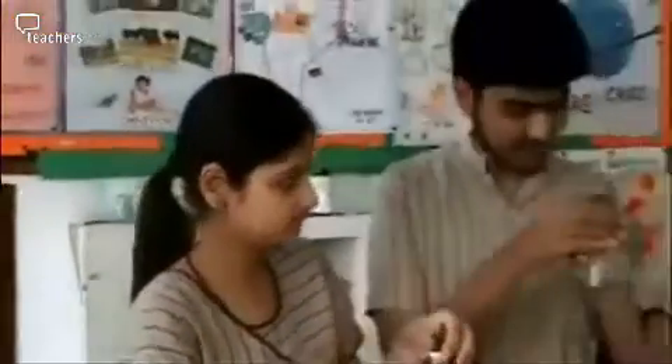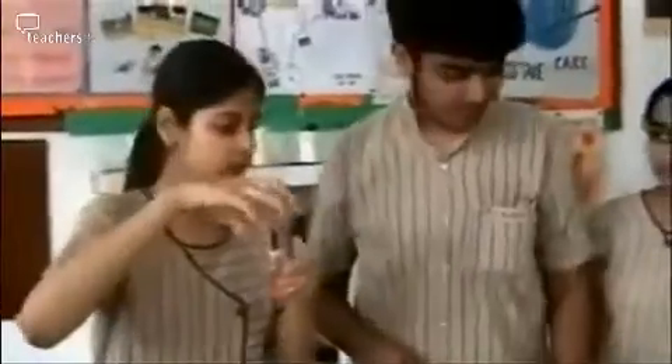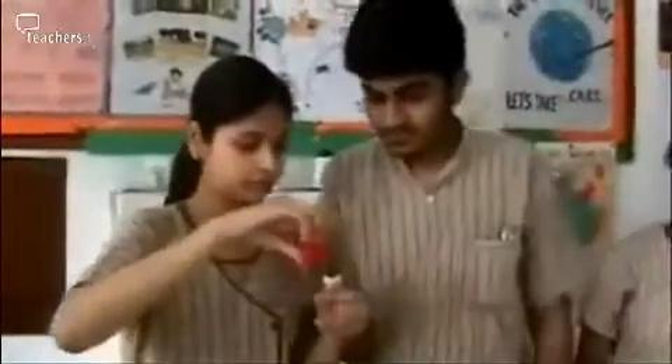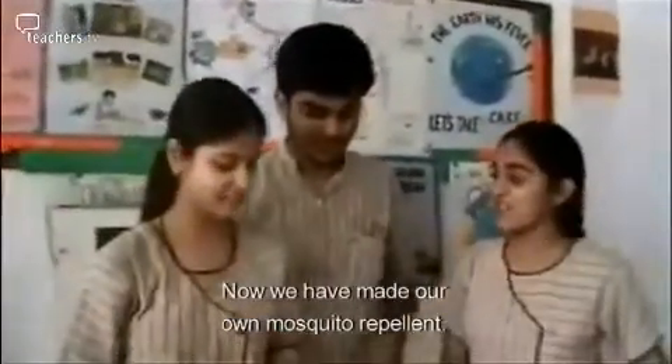Hey Ayush, can you please pour the distillate into the container? Open this container and now pour it carefully. There it goes, and now we close this. There is the closing cap for this. So now we have made our own mosquito repellent.